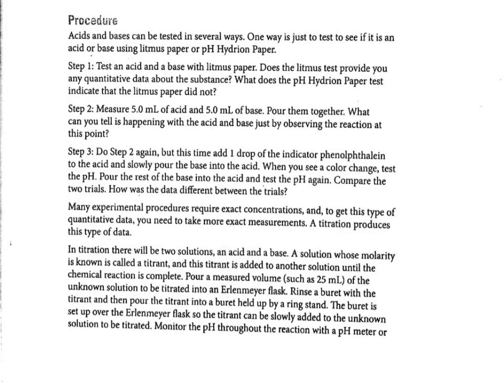The data table was the one that I gave you in class, and I think most of you just did a strong acid, strong base titration with sodium hydroxide and hydrochloric acid for the practice. We had that issue where the sodium hydroxide was a, I'm sorry, that was the day after. So anyway, that one should have been fine. You should have been able to get your data on that one, get a graph for yourself, hopefully.